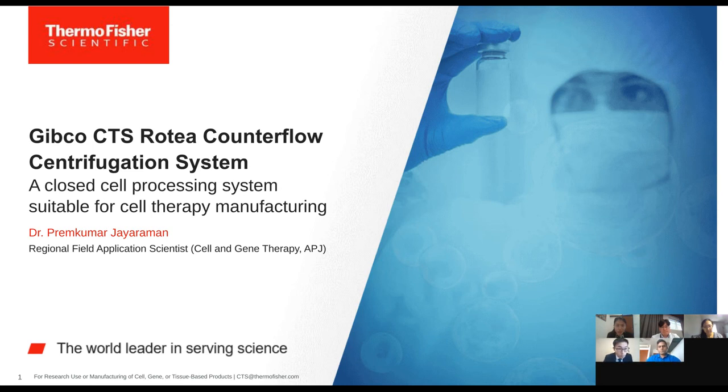Sure. Would you like to take that question in English as well? If it's a quick response? Yeah. If possible, could you answer the question if you have an answer? Sure. So the question in English is, have you used inline filter in cluster wash concentrate experiments? I mean, we can say that it's possible to use inline filters. You could simply filter if it's PVC material to the PVC Rotea kit. And again, the Rotea is very flexible. We don't see any issues at attaching an inline filter. I hope that addresses the questions.